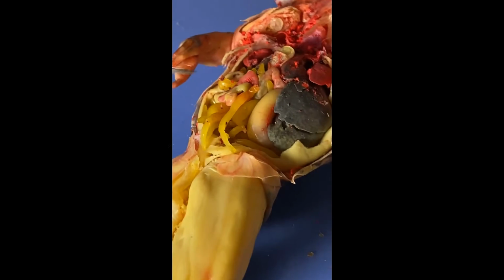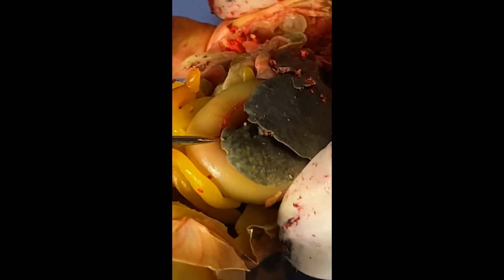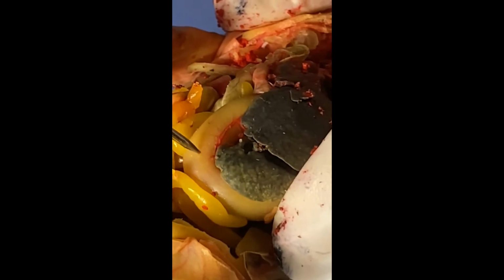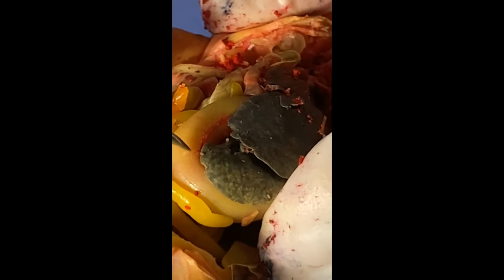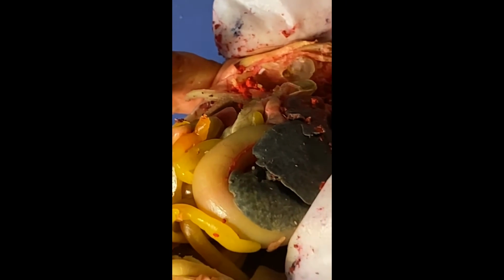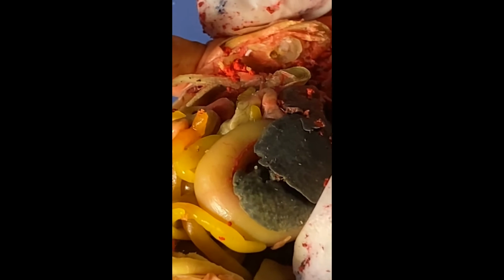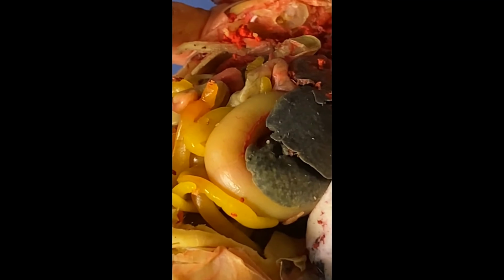Next is the stomach. You have to move the liver a little to see it, but it's this little curve right over here. And you can see that it's very muscular. So this is the stomach. And the stomach's job is to produce hydrochloric acid and secrete other enzymes. For example, it secretes pepsin that digests proteins, amylase that digests carbohydrates, and lipase that digests fats.